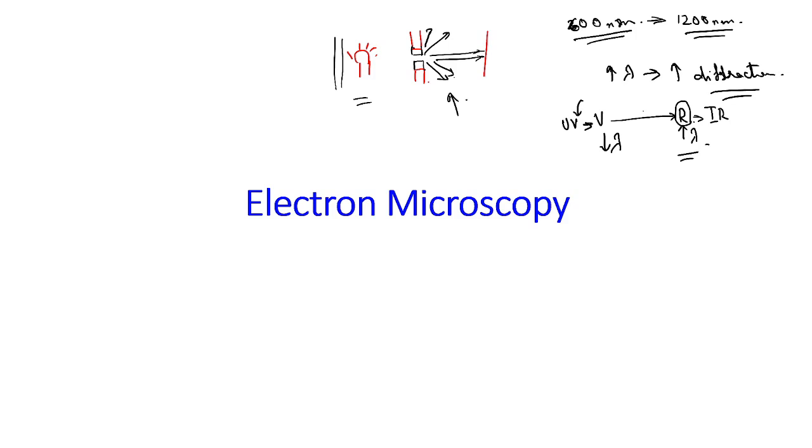Okay. However, if you go towards this 900 nanometer, the interaction would become less. And when there is a lesser interaction, the information you are getting from the rays which are coming out after the interaction will be lower. In this way you will be able to find out which wavelength of light you may use to understand the morphology of a particular object.